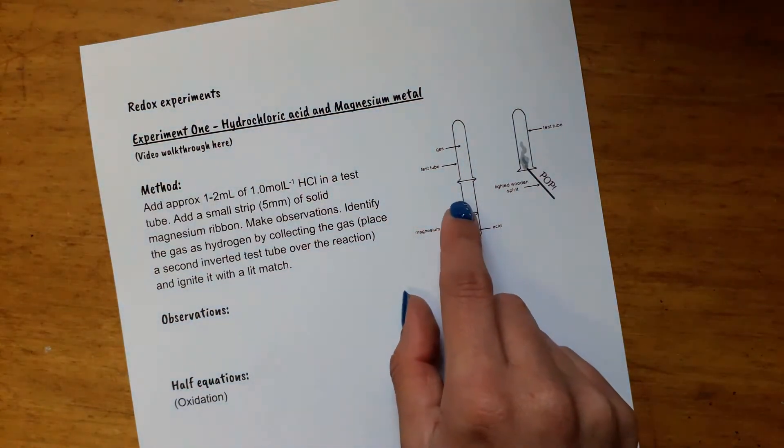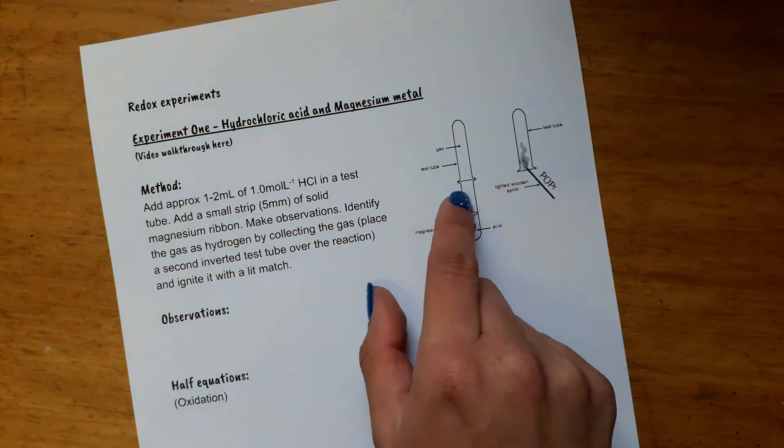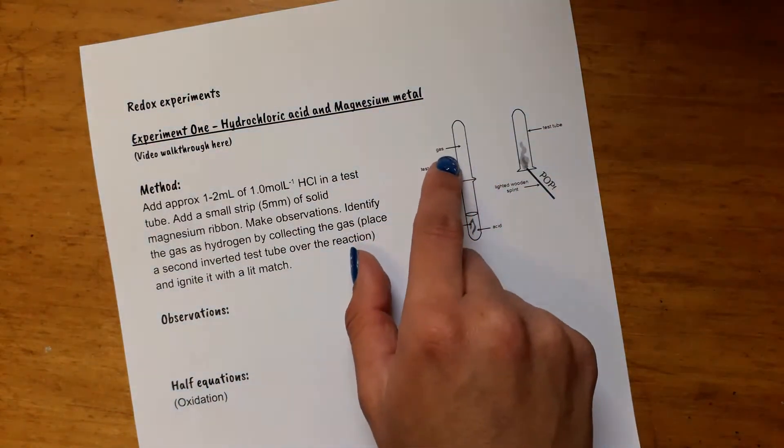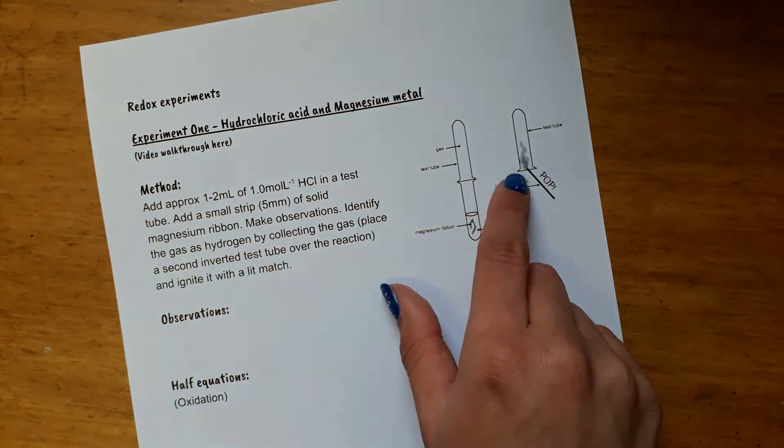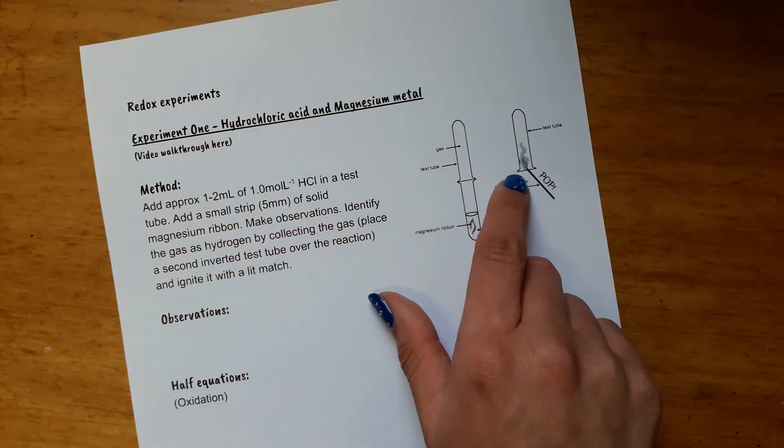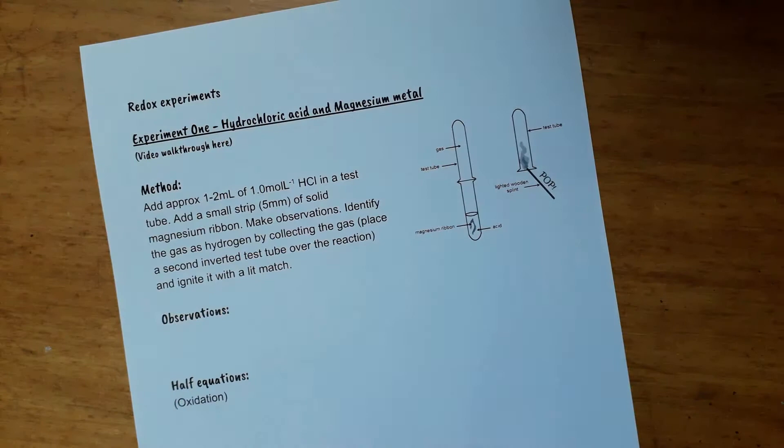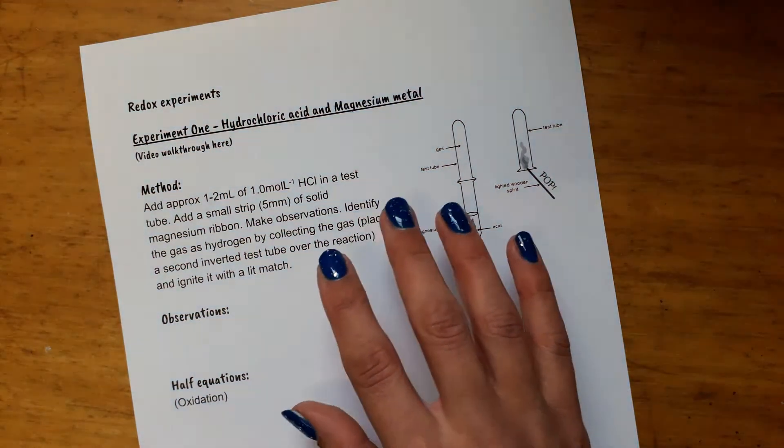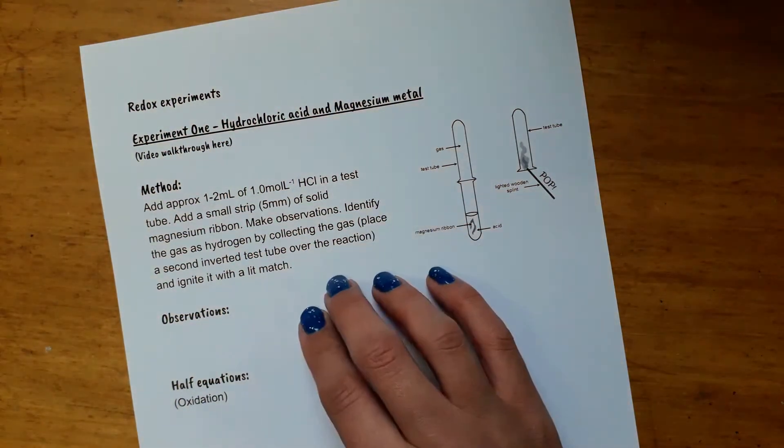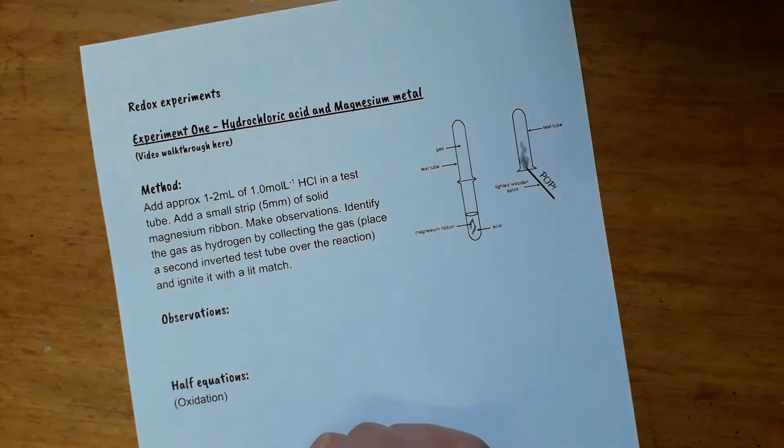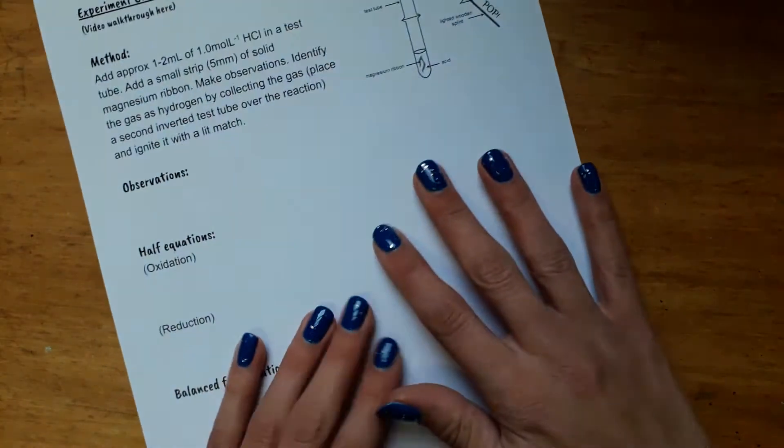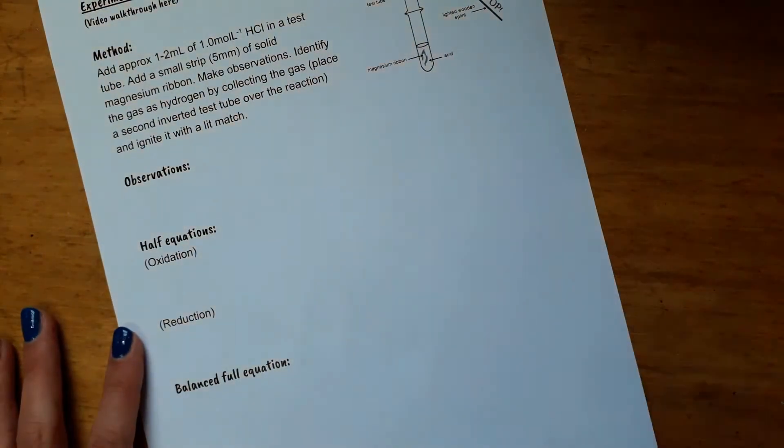So to confirm this, you would assume that hydrogen being low density will rise up to this test tube. When you collect it and ignite it, it will explode. And when you have a little amount in a test tube, that kind of gives you that pop sound. So we're going to go to the lab and do this experiment and show you what you're expecting to see. And then we'll come back and do the write-up.